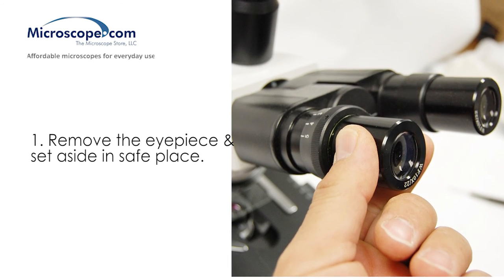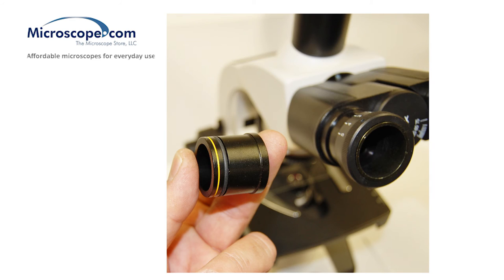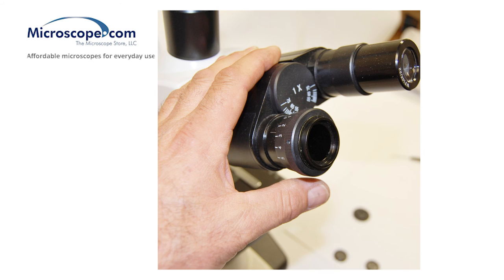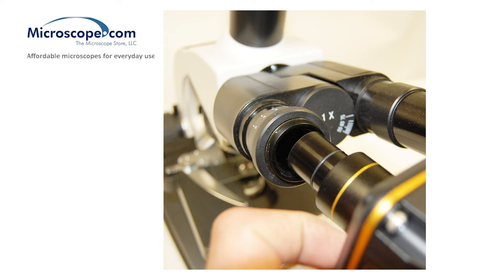First, remove the eyepiece. Next, choose the appropriate collar for your microscope — you want it to insert snugly into the ocular tube. Insert the collar into the ocular tube until it seats fully. Then insert the camera assembly with its optical adapter into the collar.